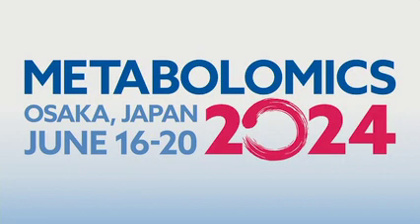Hi, I just wanted to clarify for the library building, the data quality checks that you're doing for chimeric spectra. So MZmine is automatically doing that. Is that right? You're not doing it manually? No, you just do it in MZmine, and the nice thing is that you export in the end all quality checks with the score as well. So you see what was the purity for the precursor, what was the explained intensity. So everything is already done in MZmine automatically.